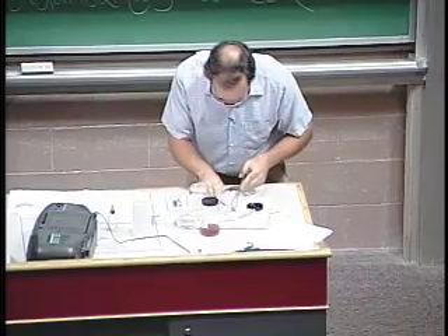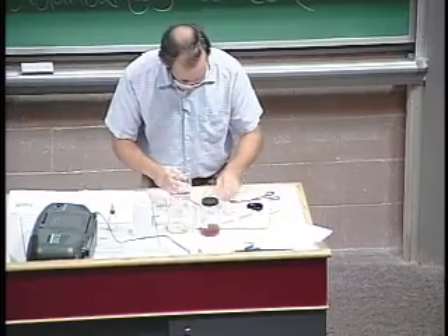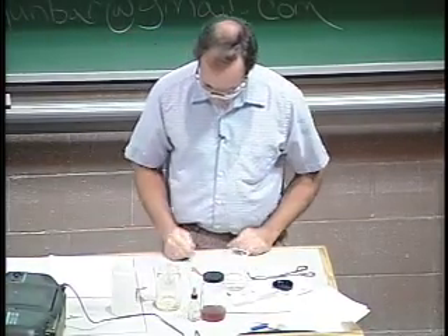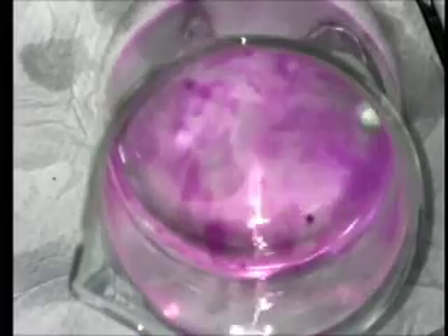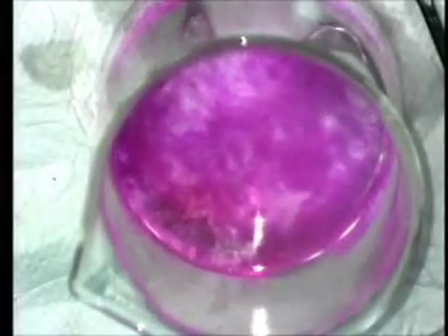I said these things react with water to form an alkaline solution. So how can we prove that it's an alkaline solution? I'll take the water here and put some acid-base indicator into it — a little bit of phenolphthalein. This will turn pink if the solution becomes alkaline. A piece of sodium metal in water — it turns pink immediately, so you can see that this is an alkaline solution, hence the alkali metal. This reaction is violent enough that the thing actually catches fire.